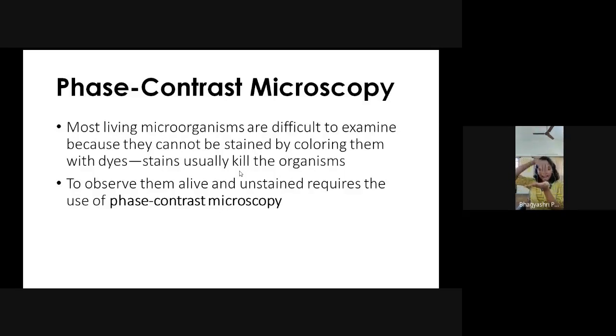If it is already dried by heat fixing, you won't be able to make a smear of that on the entire slide. To avoid that, we avoid heat fixing. We prefer air drying. Once the smear is prepared, we simply air dry that slide and then observe under the microscope, and that helps us to observe the original morphology of that bacteria, which is not possible with other staining techniques in which we perform heat fixing.